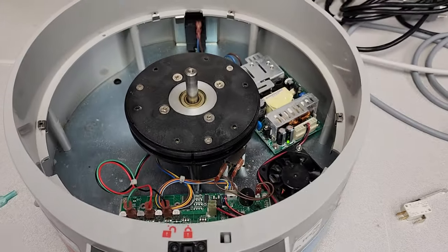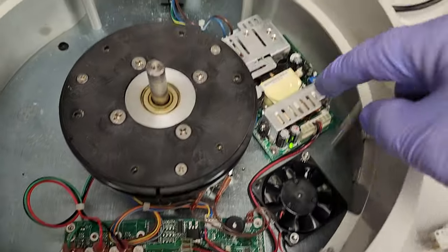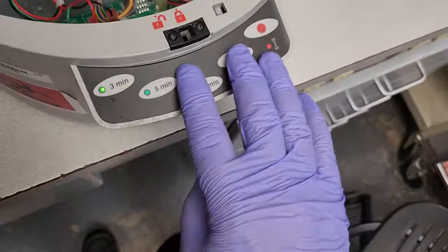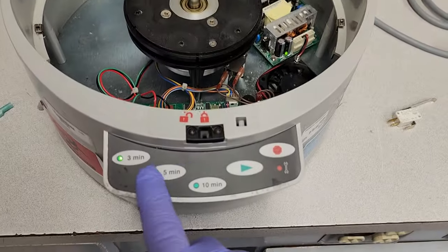This is the inside of the Stat Spin Express. Here is your motor, this is your power board, down here is your motor driver, and the CPU is controlled up and under here. The cool thing is when you go to run a cycle, this guy right here displays some sort of error code based on what's lit up.